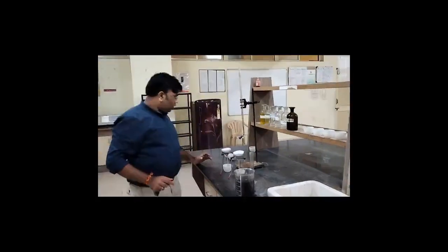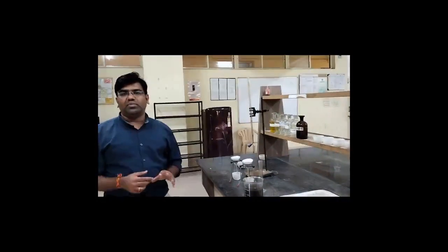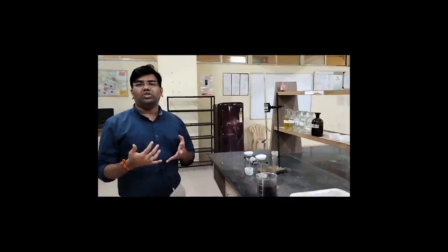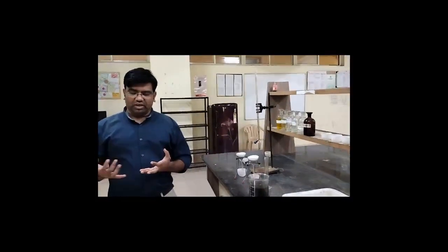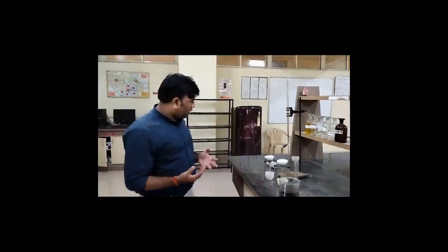Right, so what we are going to do is keep all these crucibles in a hot air oven for 24 hours at a temperature range of 103 to 105 degrees Celsius, and then we are going to take the final weight. We will be doing the calculations for MLTS, MLDS, and then we will be getting MLSS, and the value of V and the value of this MLSS will be substituted to get the value of SVI, right. So we are going to keep this.